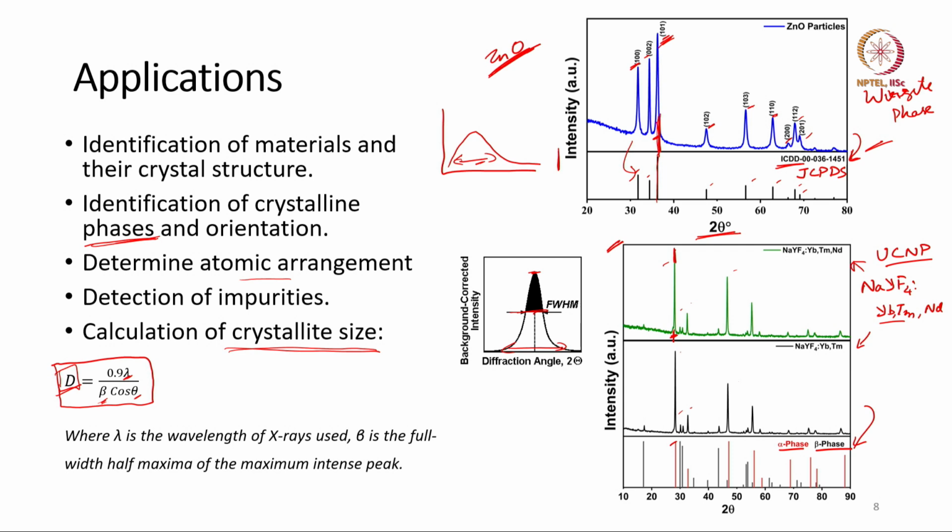Another thing that X-rays can be used for is the detection of impurities.